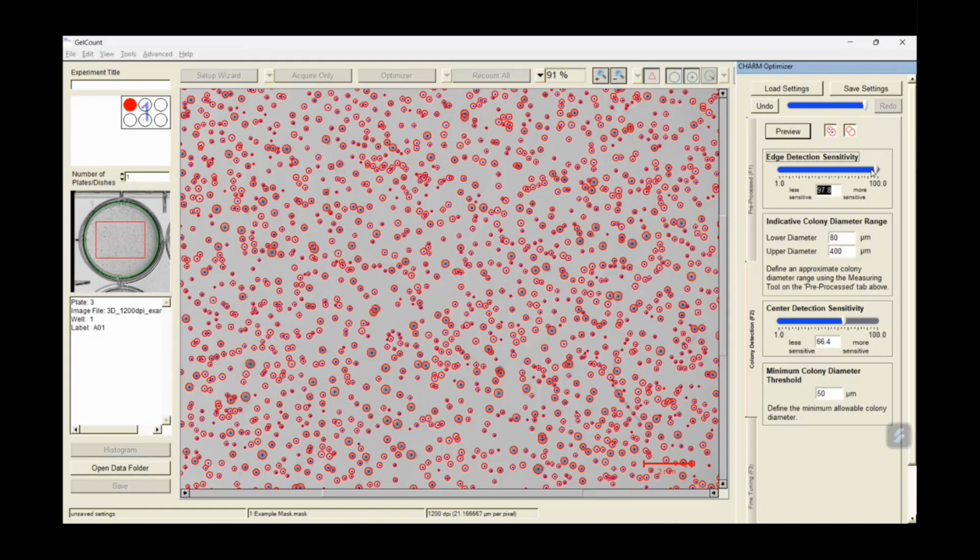And really, just an FYI, to a large extent, some of the settings, like this edge detection and the sensitivity, which I'll touch on in a second, are really meant to be used in a trial and error fashion with your organoids or colonies, just to make sure the software is able to detect what you want to delineate a colony from the background or any artifacts. I'm going to set this about here to get it into a good range.